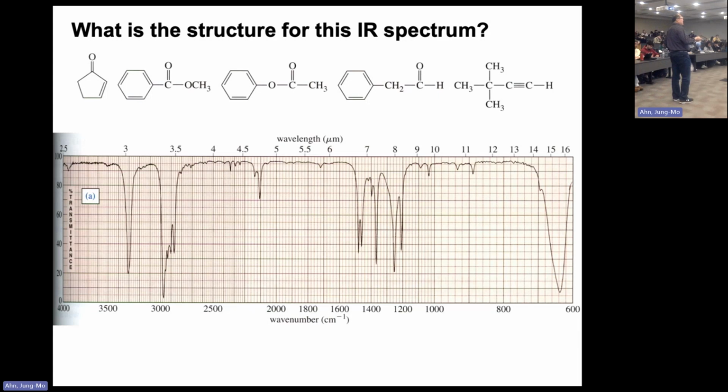So that means that these might be triple bonds. If that's a triple bond, this makes sense. If the triple bond has a hydrogen like this, then this signal is going to show there. But if this signal is there without that, then it cannot be the triple bond with hydrogen, right? It has to have both. And this example definitely has both the triple bond and the sp carbon-hydrogen bond. That is responsible for this one and that one.